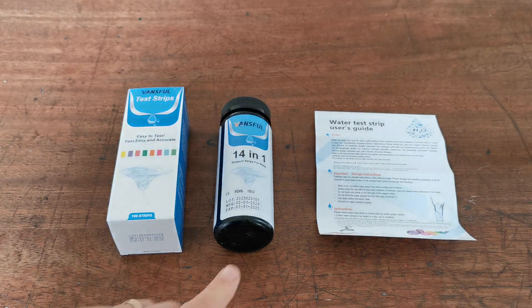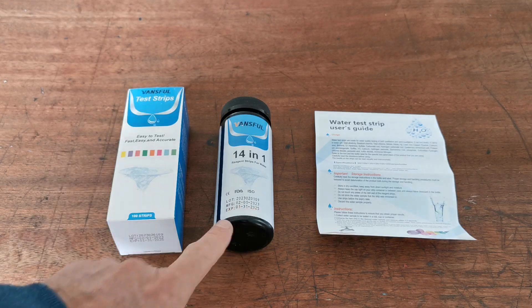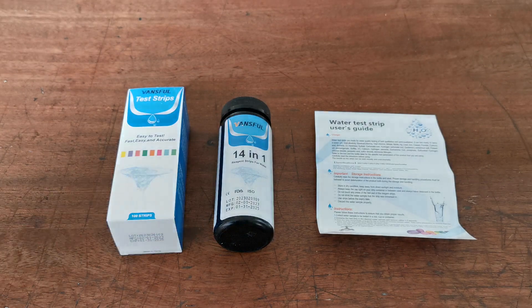These were manufactured in February 2023, and the expiry date on the current batch on Value Med is the 31st of January 2025. Just to draw your attention to the fact that the dates are in US format, as opposed to UK format.